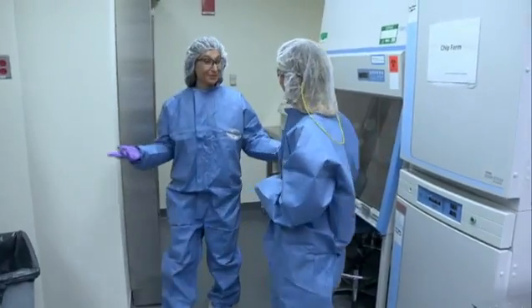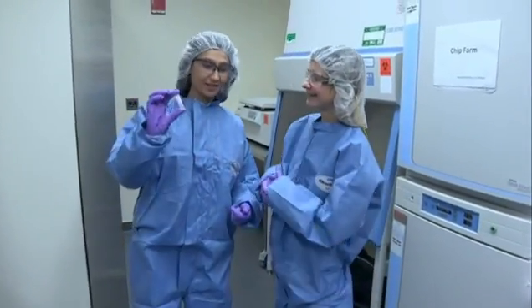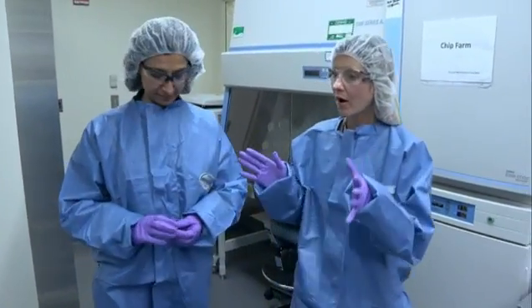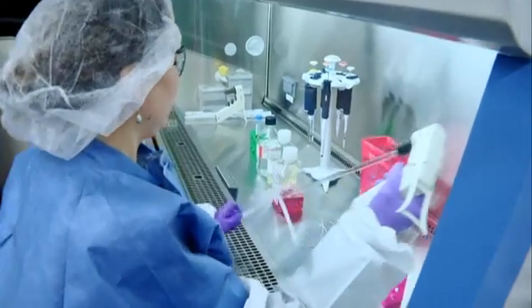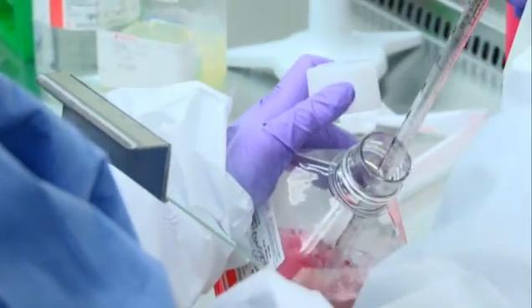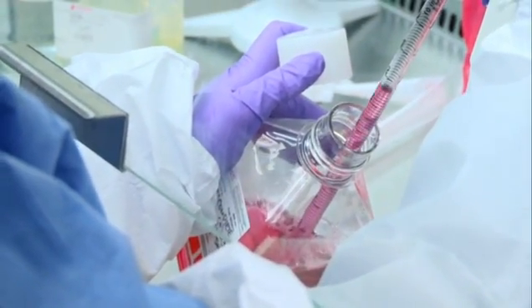So now we're all suited and booted. Yes. I have the vial. So what now? So now we actually take the cells and we process them so that you can get the cells ready to put on a chip.